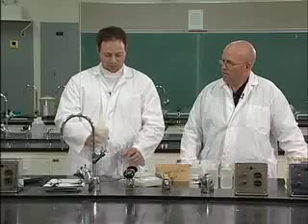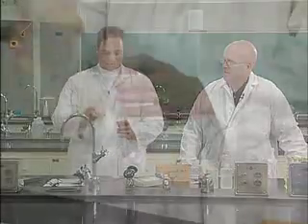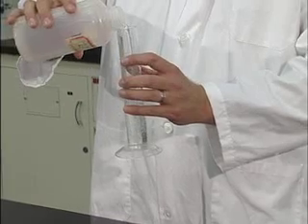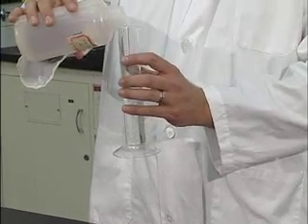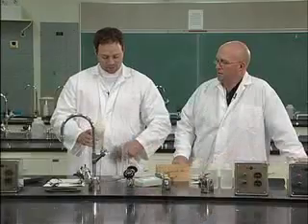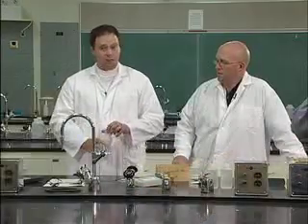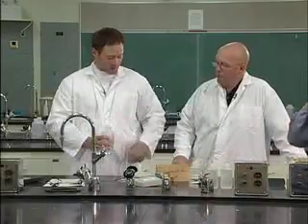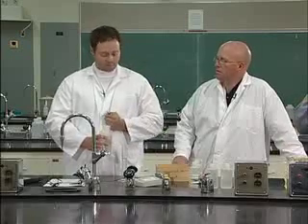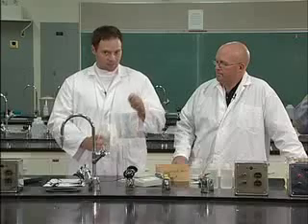So just remove the top of the distilled water bottle. And now why are you picking 70 milliliters? We're picking 70 milliliters because this graduated cylinder is graduated at 10 milliliter intervals to a total of 100 mils. And none of our objects go more than 30 milliliters volume, so they will fit on our scale.